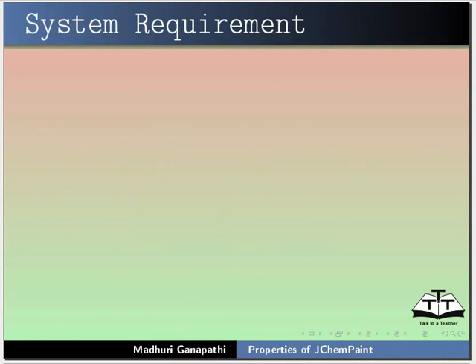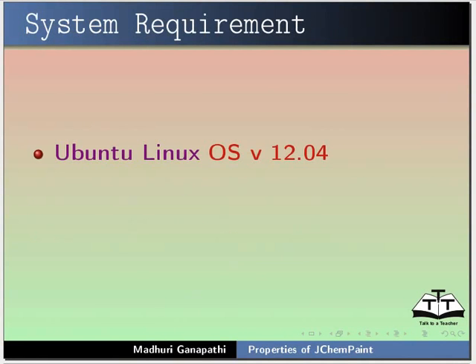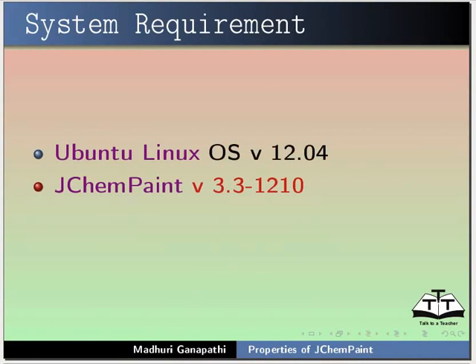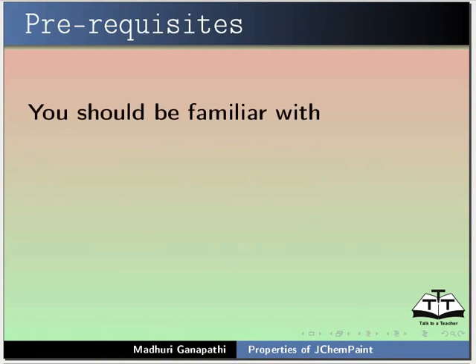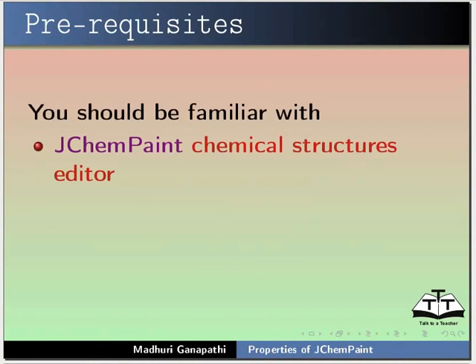To record this tutorial, I am using Ubuntu Linux OS version 12.04, jChemPaint version 3.3-1210, and Java version 7. To follow this tutorial, you should be familiar with jChemPaint chemical structures editor.